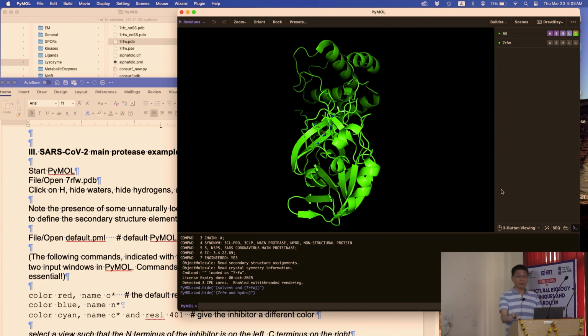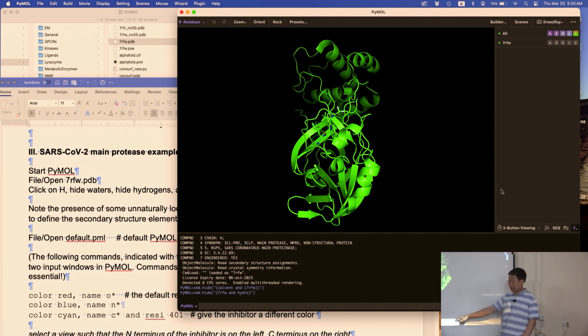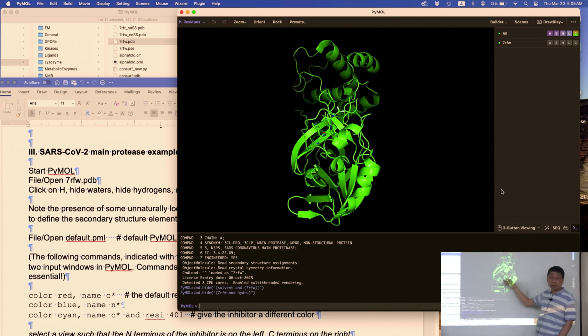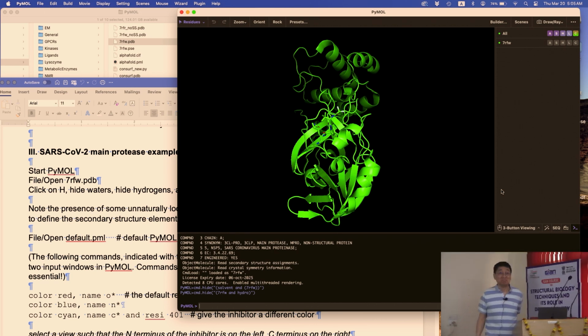You look confused already over there. Everything's okay? Yes. Did you open this file? I'm sorry? I didn't get the... So do you have the primer? The primer file right here? Open the Word file and then open the PyMOL file, the PDB file. Okay? All right.